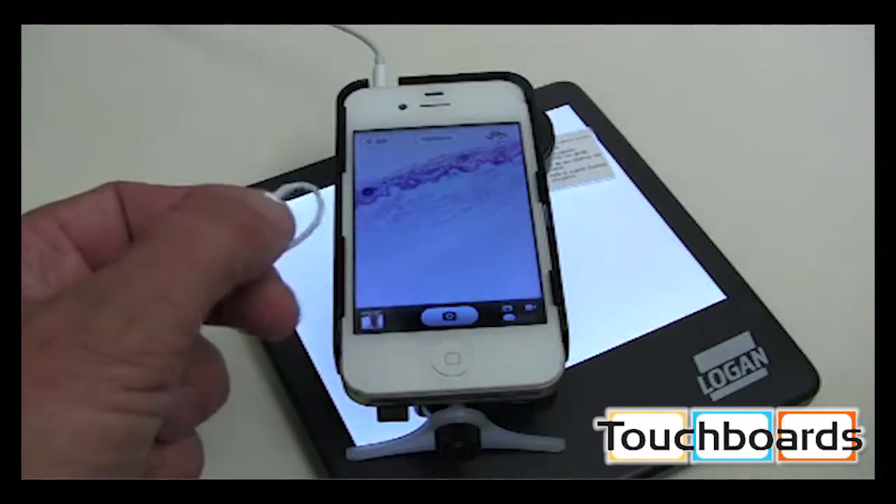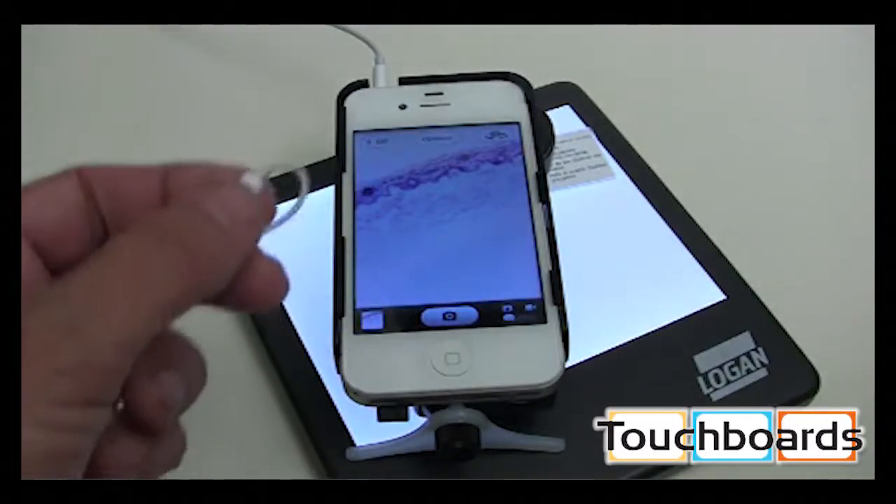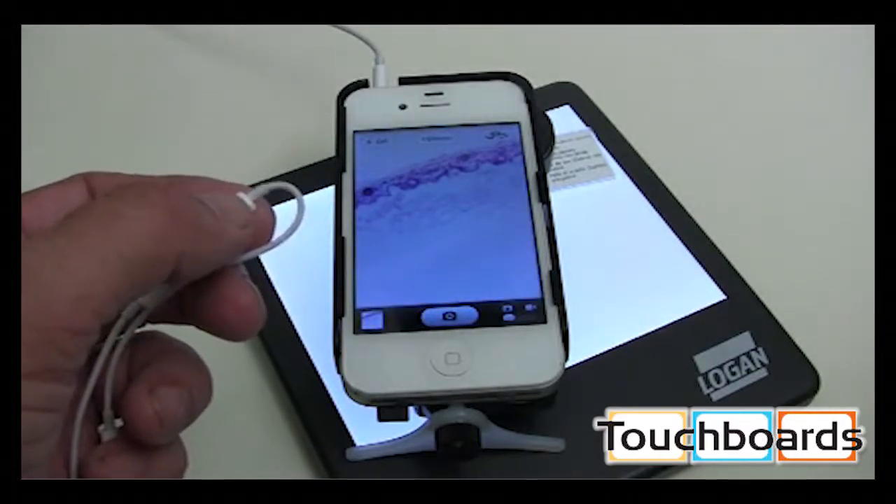Or, to make sure you don't jar the iOS device by tapping, use the plus sign on your iOS earphones to take the photo without touching the screen.